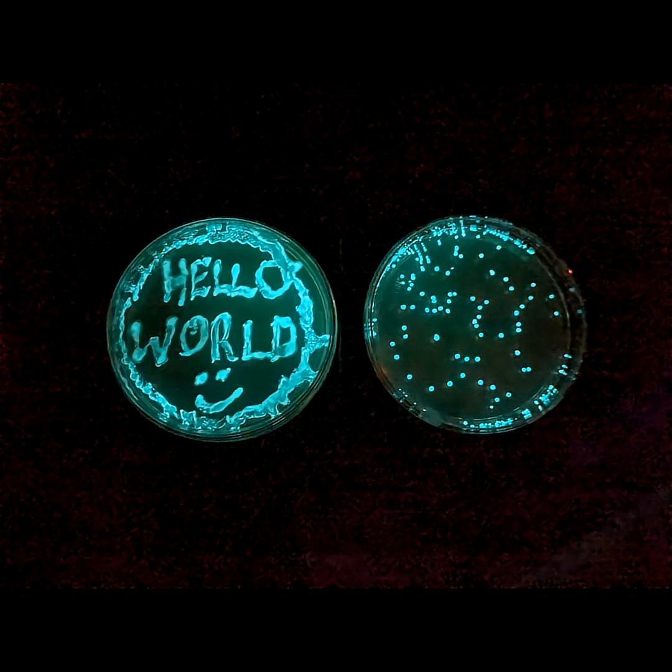In this photo, each colony formed from a single cell that successfully took in the new DNA. I've designed my own plasmids, which are being assembled as we speak, so stay tuned for a future video where I can see if I manage to make a new colour.